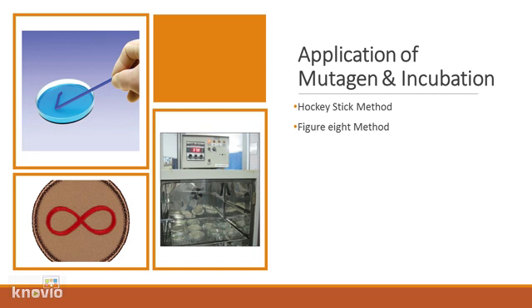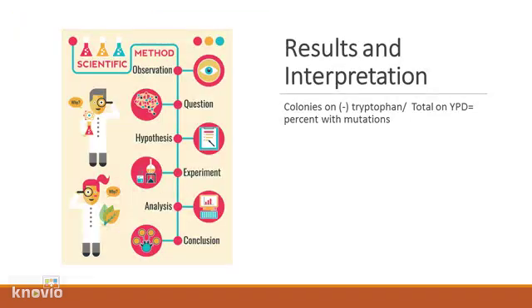Incubation, generally, really depends on what you're trying to grow. But for yeast, the ideal growth temperature will be around 30 degrees Celsius. And then to conserve the yeast that has grown, you would put it at 4 degrees if for some reason you wanted to keep it for a little bit longer.